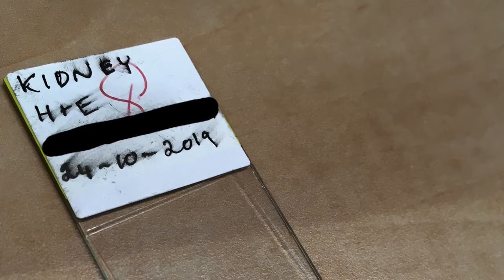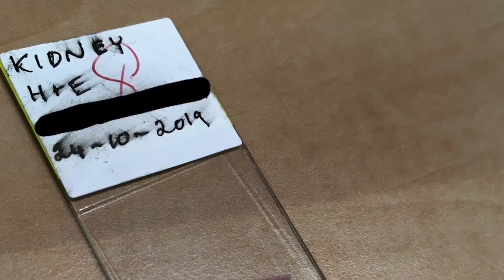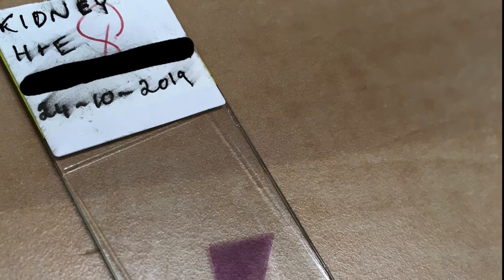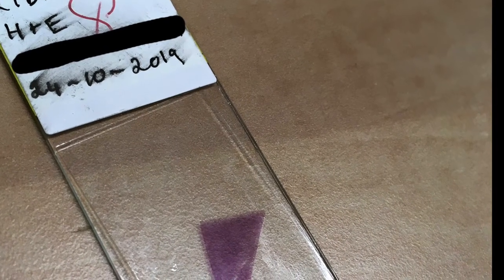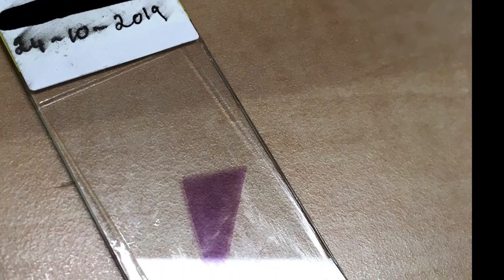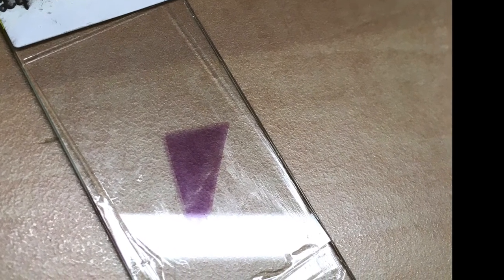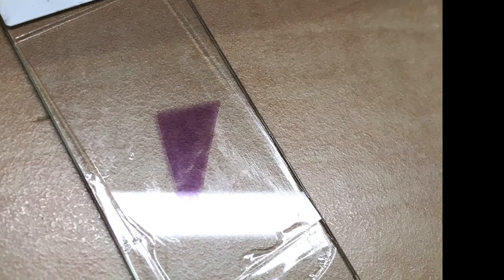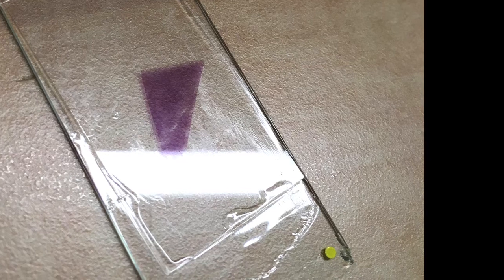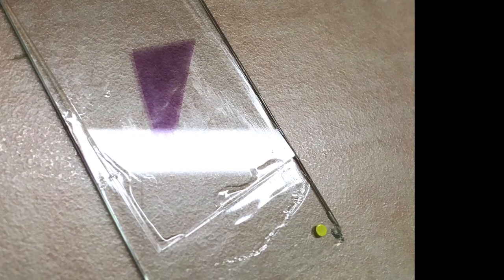Now, as students begin to improve their technique, they're generally approaching something a bit more like this slide. This actually scored 8 out of 10 or 80%, based upon the quality of the stain, but also the cover slipping has some minor issues associated with it. We see there's not so much of a problem with adequate mounting medium, but the slide has drifted a bit in those first few minutes following being cover slipped, and that's resulted in the cover slip just marginally hanging over the edge of the slide. So it's not affecting the ability to achieve a diagnosis. However, that minor issue could have been corrected, and whilst it's not a major issue, it is quite important from a health and safety point of view to not have bits of glass hanging off the edge.